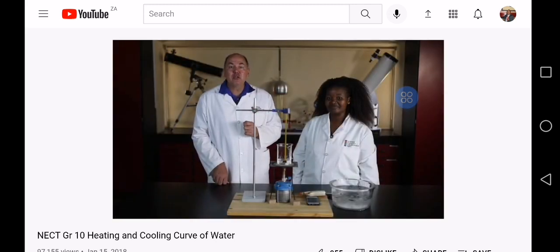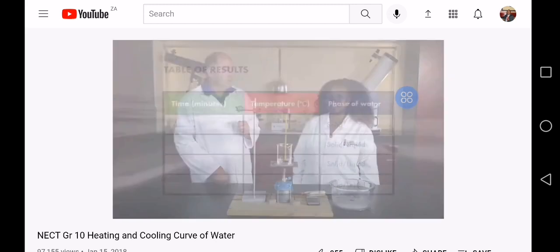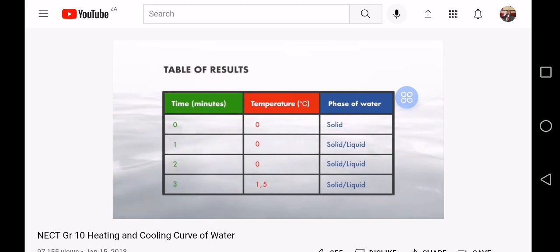Finally, the SI units are shown in the column headings. Don't write the SI units in every row as well. This is the correct way to record your result in a table. It's nice, neat and clear. It makes it easier to work with the information when you analyze it. Some of you may have made a few mistakes in your table and perhaps you want to correct them nice and neatly. We have printed another table exactly for this purpose. You can transfer your results later and make a clean start.